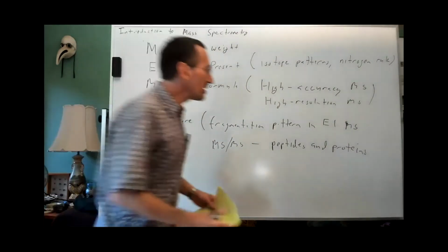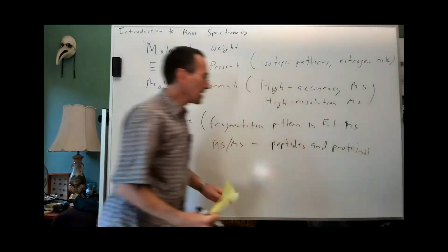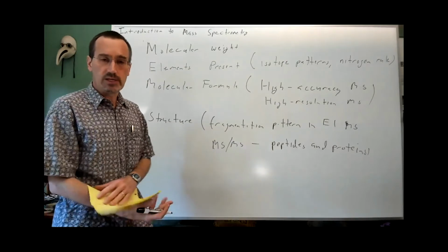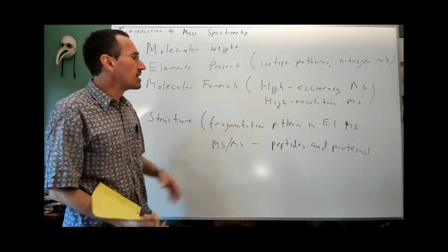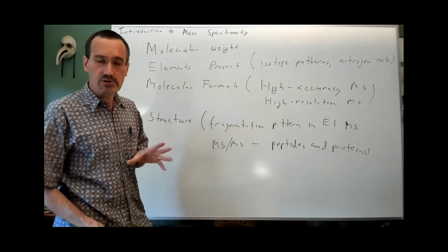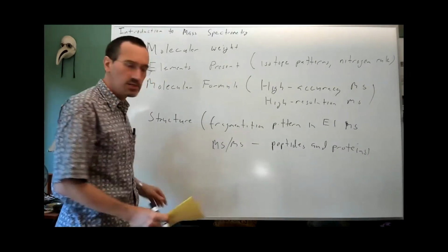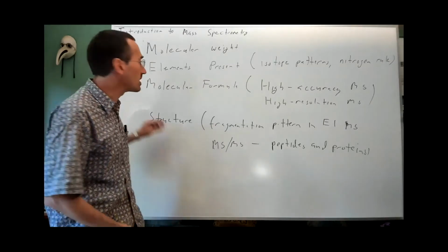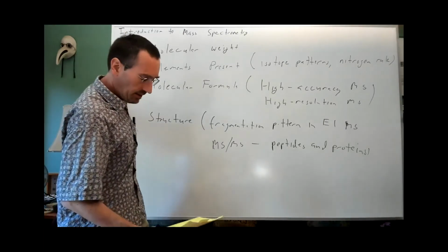We're not really going to be focusing on biomolecular mass spec. So if you are going to be doing proteomics, you'll want to be reading on your own about the techniques, because there's a whole bunch of more specialized information, including things like tryptic digests that come into play.